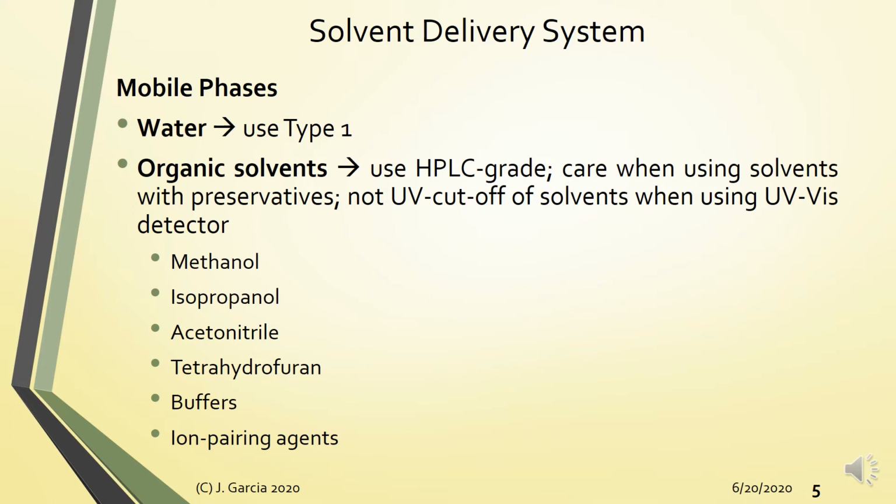So if a solvent typically contains preservatives, yung sa AR form, yung HPLC grade na form niya, preservative free, because these added components might interfere in the analysis. So example ng solvent na pagka AR grade ay typically contains preservatives would be your tetrahydrofuran. If you have an HPLC grade THF, it's preservative free actually.